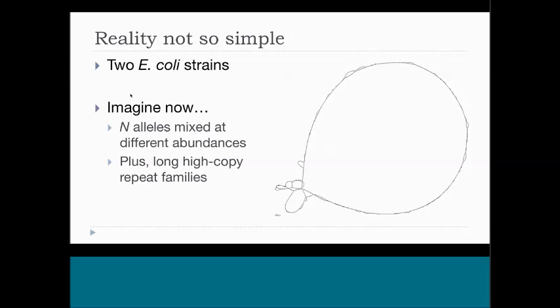If we just do an experiment where we take, for instance, two highly related E. coli strains and co-assemble them and look at the diploid assembly graph, we get something like what I show here on the right. For the majority of the chromosome, the bubbles are pretty well behaved. You can see them popping up where there's haplotype difference between these two E. coli as you go around. But then when you hit the highly repetitive regions of E. coli, around the rDNA loci, it becomes difficult to separate the haplotype differences from repeat structures in the graph. And this is really what causes the diploid assembly problem: it can be hard to tell what's a duplicated allele on a single haplotype from two alleles on multiple haplotypes.